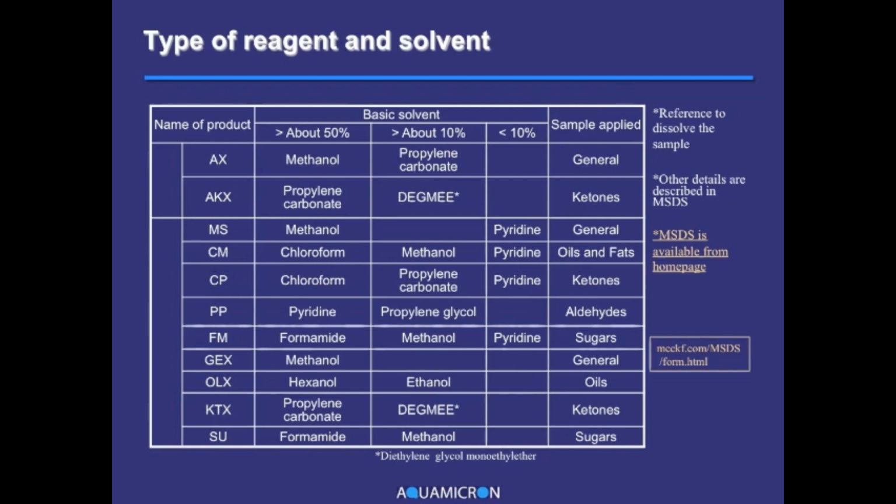Firstly, with regard to the Fire Defense Law, all the solvents are flammable liquids categorized in Class 4 of hazardous materials, except the titrants SS series and the dehydrating solvents CM and CP series, which are non-hazardous materials since they have no flash points due to their high concentrations of non-flammable chloroform.